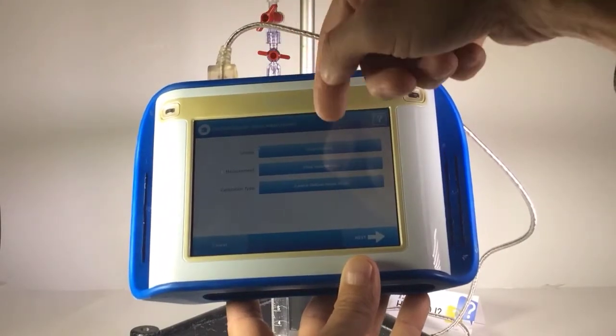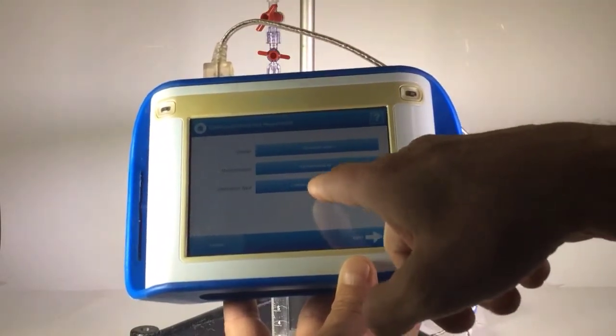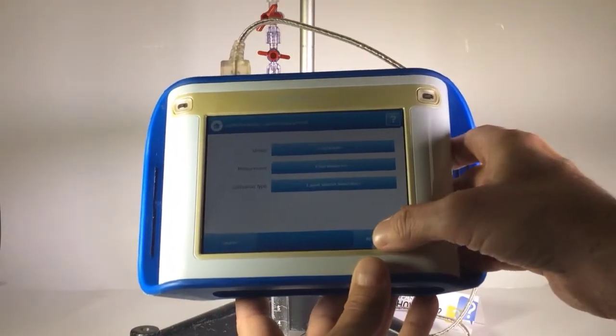It defaults to drop counter, fluid volume, one point, slope adjust only. That's the default. That's really good.